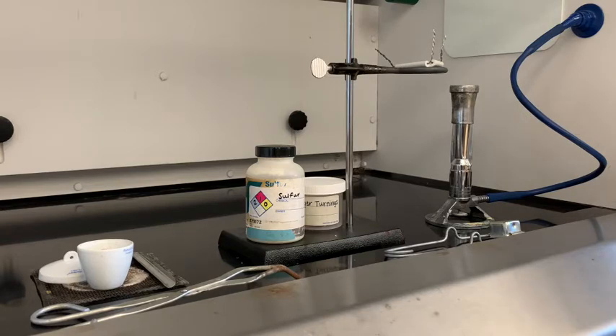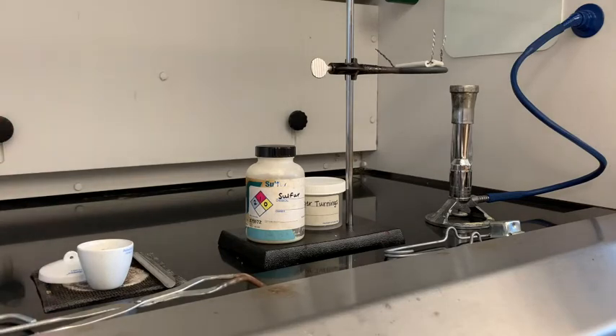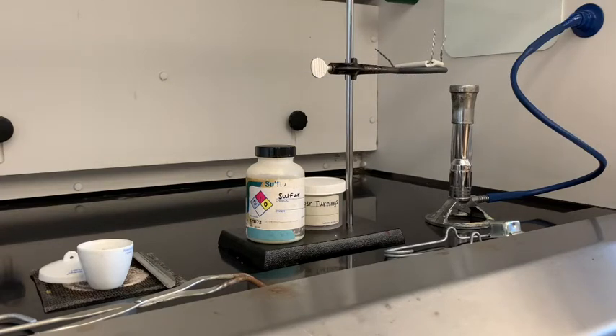I also have some crucible tongs so that I can carry the crucible, because after you heat it up the first time you do not want to touch it again — you're trying to heat to a constant mass. The oils from your fingers could affect that mass, so you don't want to touch it. Also, after it comes off the Bunsen burner it's going to be very, very hot. I also have my crucible and lid in the hood and a stringer.